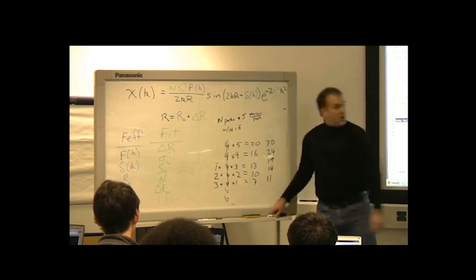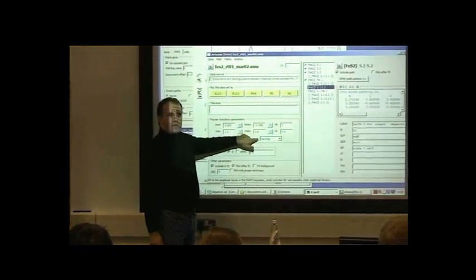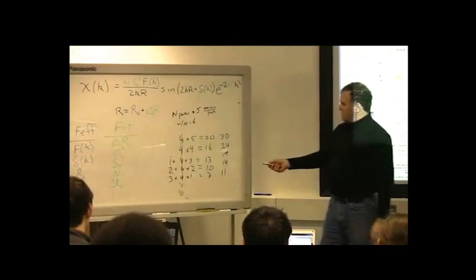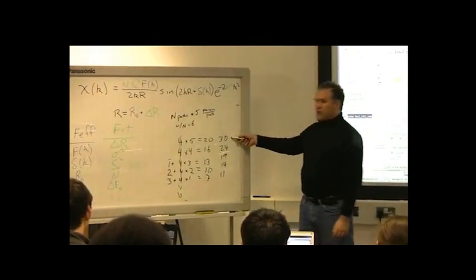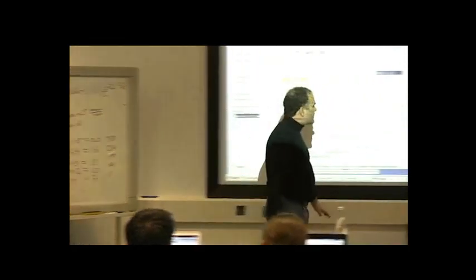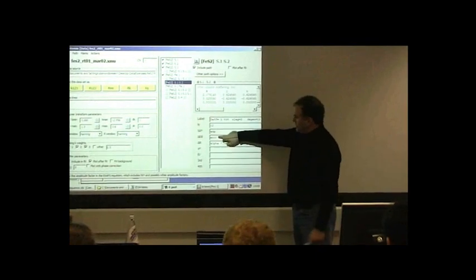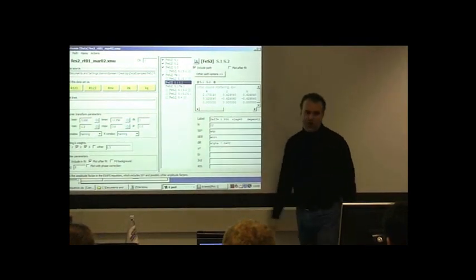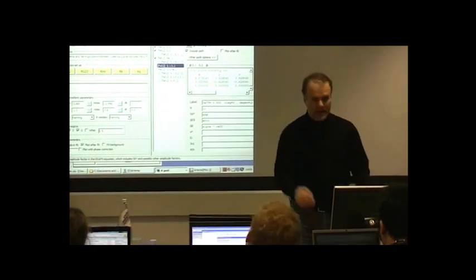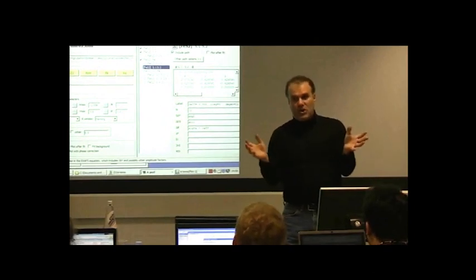But we're not going to really change this number, right? Our total number of independent points doesn't get any bigger, but it would seem at the beginning that our problem got vastly worse by adding too many paths. But of course it's not vastly worse, because there's just one S0 squared, there's just one E naught. The isotropic expansion trick works for a multiple scattering path because it works for every leg of every kind of path in the problem. It's a cubic material and it's an isotropic expansion.